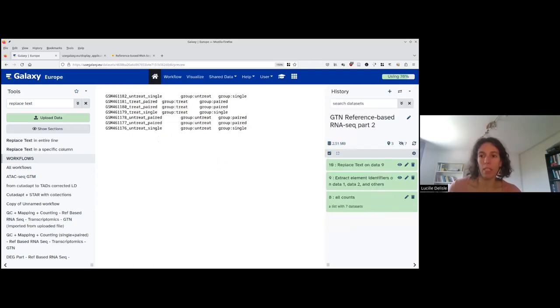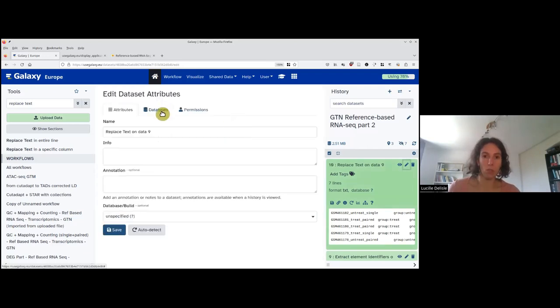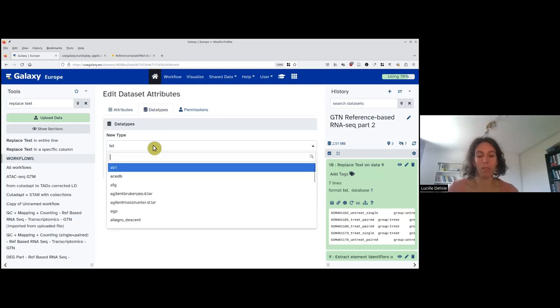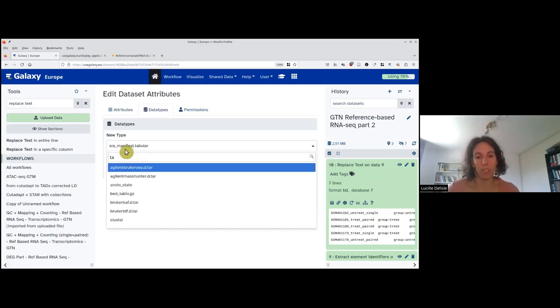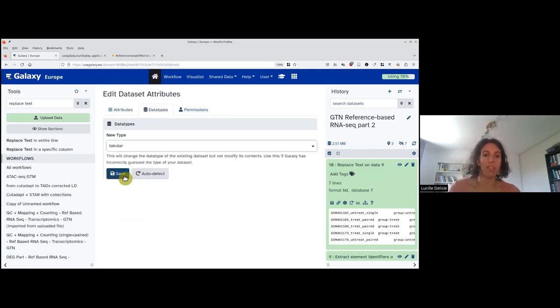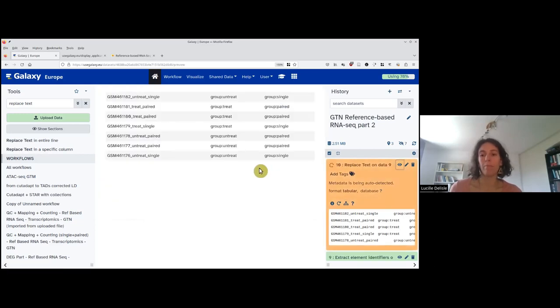Now we can go back and check the data type — it's a txt, but I would like a tabular. To change the dataset type, I click on the pencil, go to the data type, type 'tabular,' select it, do save, and now you can see it's a tabular. If I display it, it's more separated and aligned.